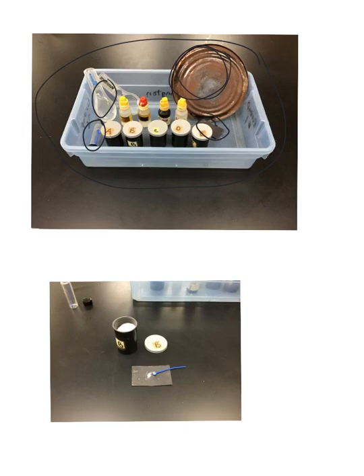All right, so when you come to the lab, the first thing you're going to do is take down the physical appearance of the powder. So you're going to open up each of the powders, and you're going to put a very thin amount onto the poster board. Spread it out a little bit. Again, don't use your hands. Try to use aseptic technique. And then look at it.